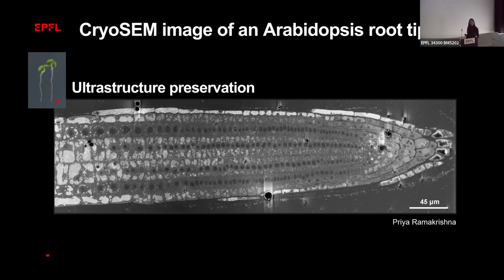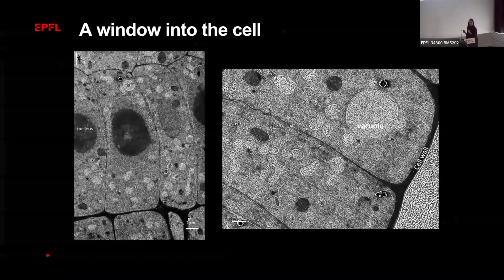You can now start probing this to understand what's going on in different parts. As a plant biologist, I can tell you which cell type is what and what function it has, and what kind of things you can expect biologically to study from these different cell types. And here are some more pictures. It's an imaging seminar. I'm not going to go short on pictures.